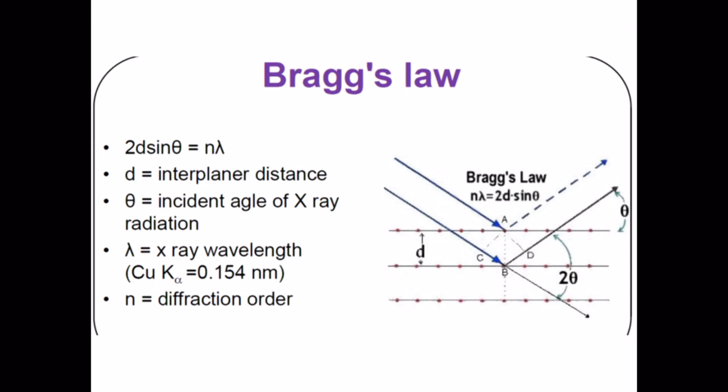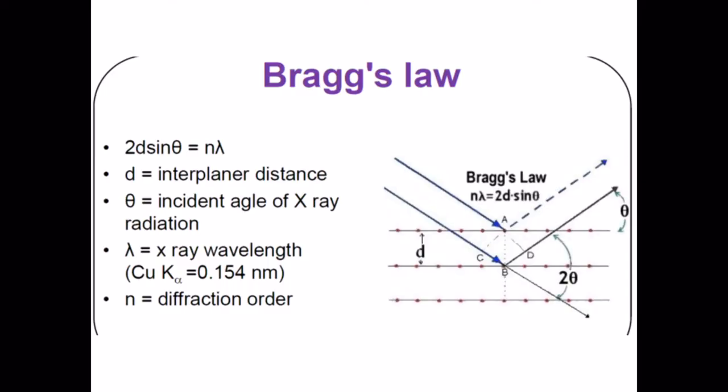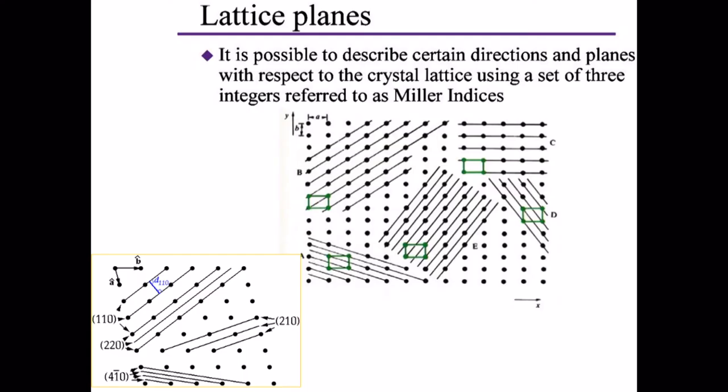Any material, the first characterization one does with the material is X-ray diffraction. You have to understand the grown material, or the developed or synthesized material, whatever material you have developed, whether it is crystalline, amorphous or polycrystalline. The fundamental character of the material one understands with XRD. Powder XRD: you try to make a film or powder, or even if you have a boule, you try to keep it in the machine and understand the characteristics. It works basically on Bragg's law, 2d sin theta equals n lambda, and you try to keep the material.